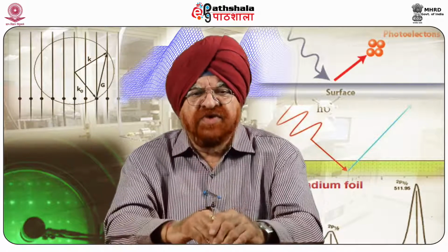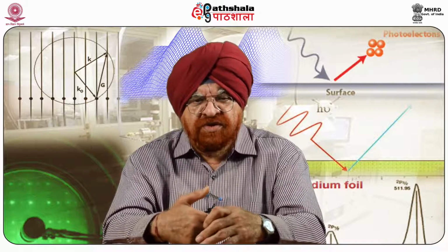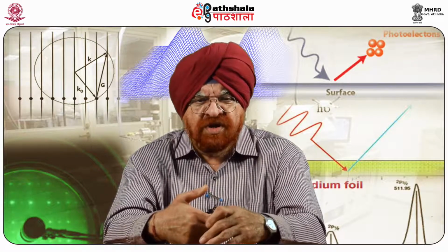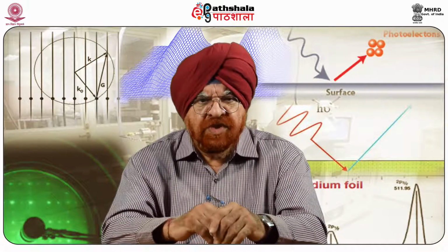Nowadays, the main developments in MFM are focused on the quantitative analysis of data, improvement of resolution, and the application of external field during measurements. This was done by Schwarz and Wiesendanger, 2008.